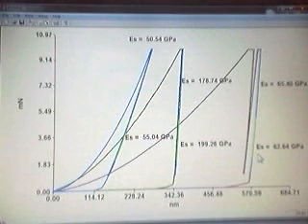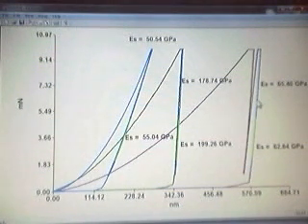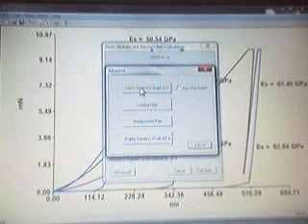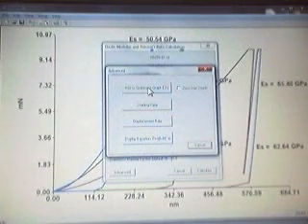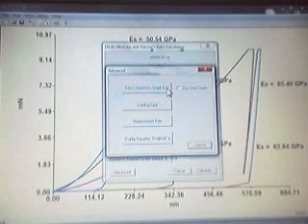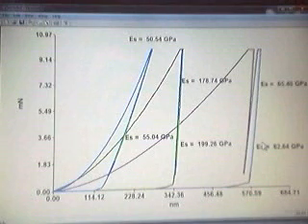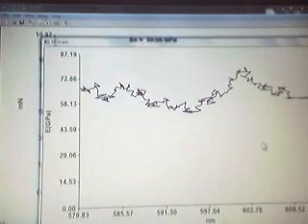What we'd like to do is actually see what the elastic modulus does along each one of these sections without having to click on and enter the section of the curve one by one. To do that, you can use the advanced function. So you just click on Add to Graininess Graph, Elastic Modulus versus Height. And there you go.